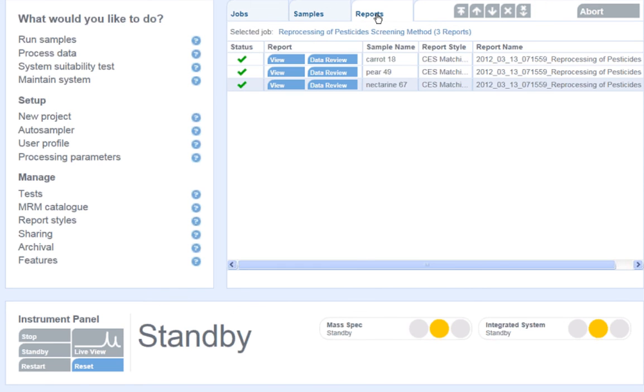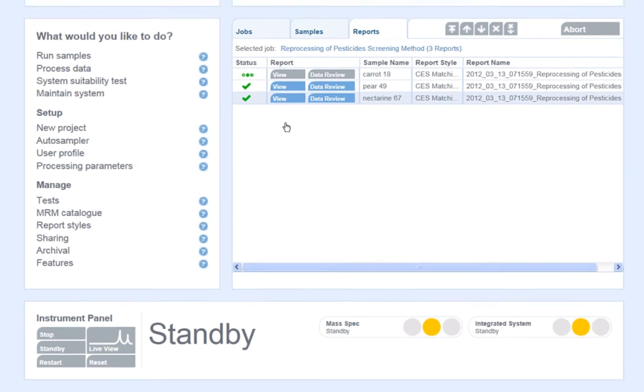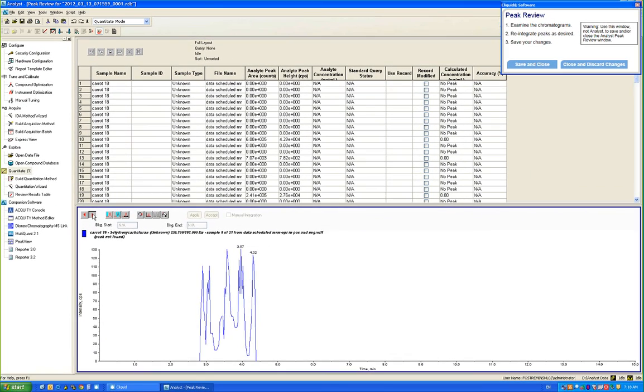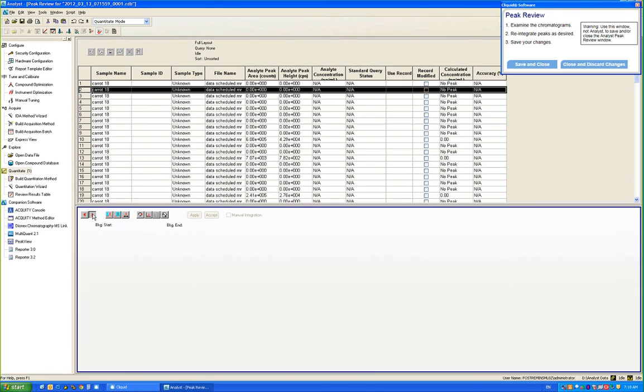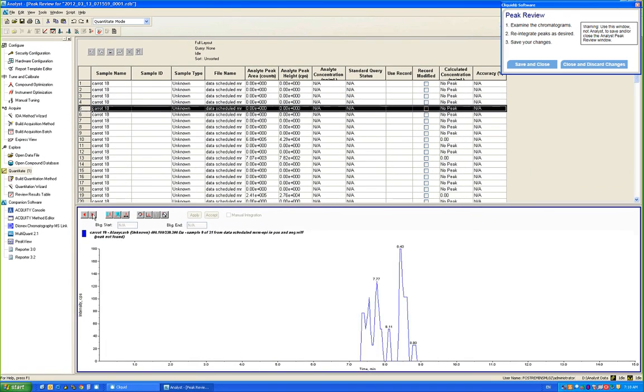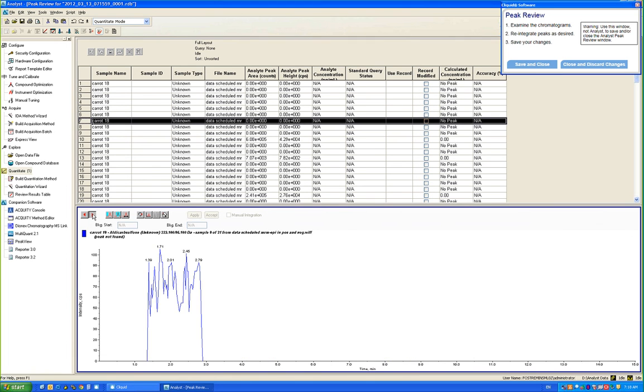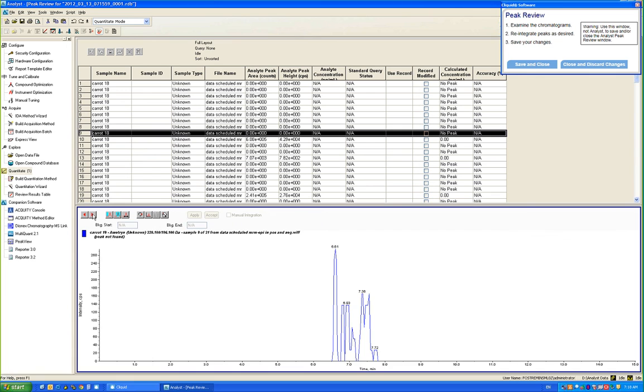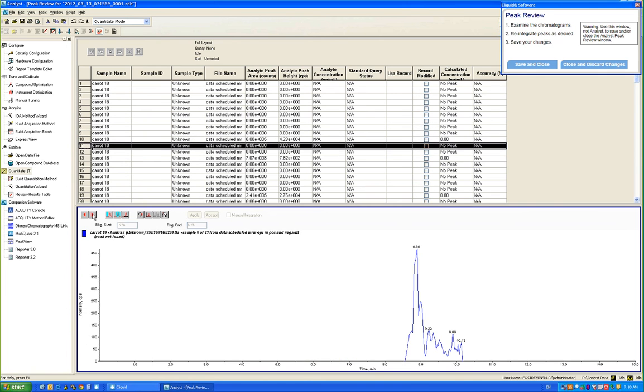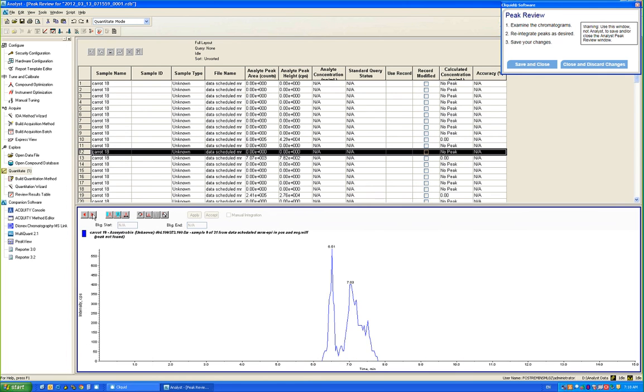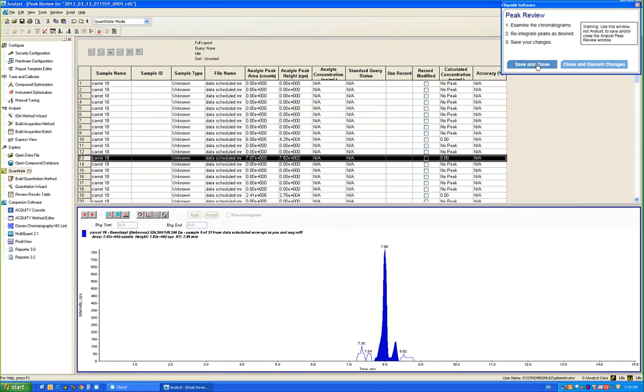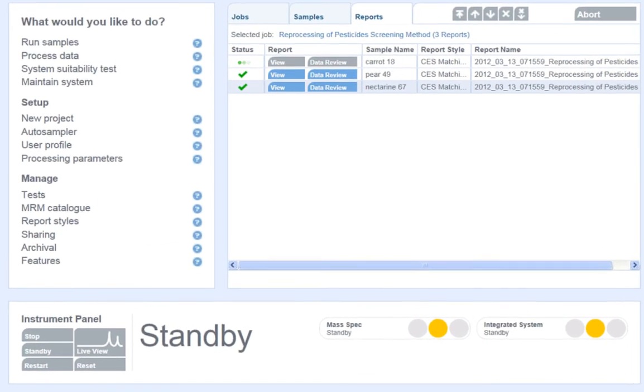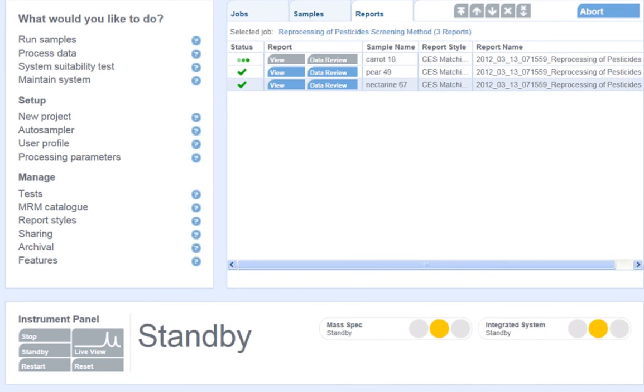If I would like to reprocess the data for the sample because I question the way the software has integrated the peak, I can simply click Data Review to the left of the peak name. This will open Analyst for the sample and allow me to reprocess the sample as I deem necessary. I can make any required changes and save and close. The report will run again, this time using the quantitation method I have just updated.